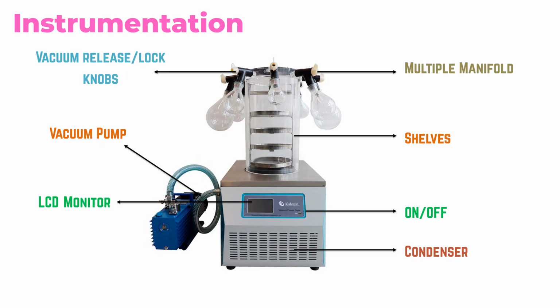The next step is secondary drying, once primary drying is complete. Primary drying will take several hours; as we discussed, it is around 20 to 24 hours. At secondary drying, increase the temperature to facilitate desorption of any remaining solvent or moisture in the formulation. After that, cooling and sealing is carried out, gradually reducing the temperature to ambient conditions to cool the dried product.